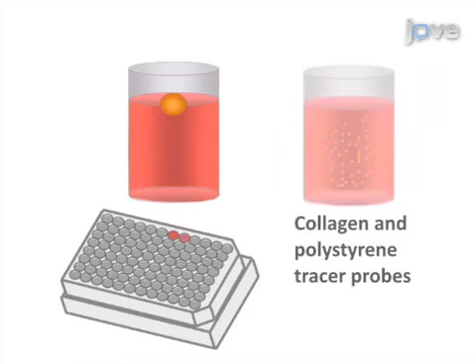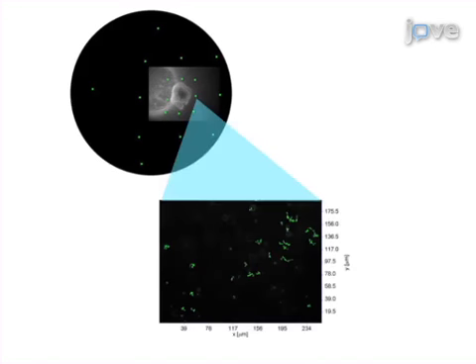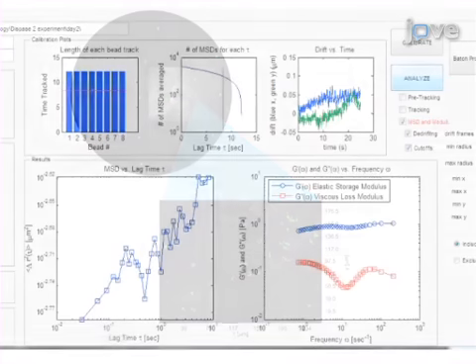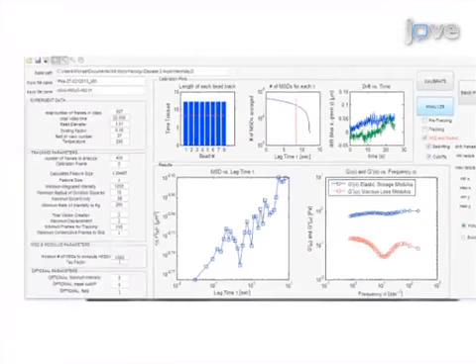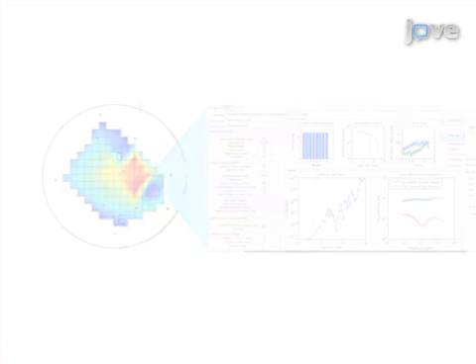The second step is to embed the tumor spheroid in the collagen or other appropriate extracellular matrix. Next, the grid of sample points is constructed and a video is taken at each point. The final step is to analyze the video data and compute and co-register rheological properties at each spatial point.